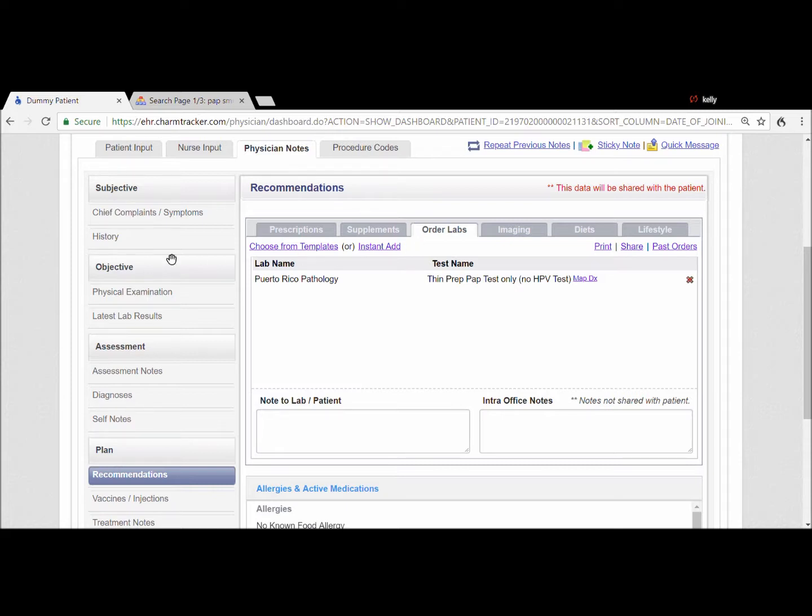From the patient details section, it pulls the address of the patient and phone number. The lab requires this in the event that the lab will send a bill to the patient or any necessary co-pays in any plan médicos, and in the event of an emergency where the lab needs to contact the patient directly. The provider and facility details includes the doctor, the ordering physician, and the NPI number of the ordering physician, as well as our address and phone number where to contact us. That's also essential.